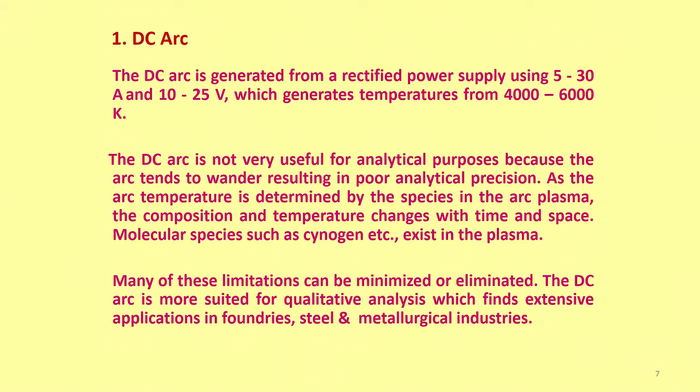You see, there are always uses for different kinds of arcs, and DC arc has been used for several decades for qualitative analysis, for which you do not need a steady arc. You just want to know how many elements are there in a given sample.